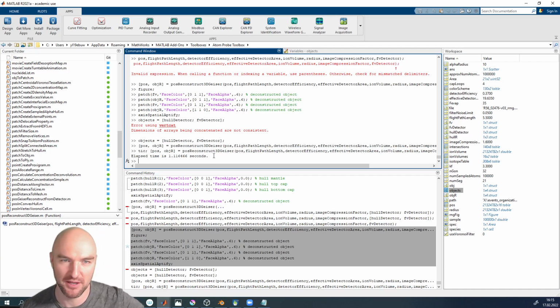yeah, so it takes about a second or so to reconstruct those 20 million atoms. It doesn't take very long. By the way, this is on the CPU. On this computer, you could also go onto the GPU, and then it would be a couple of milliseconds, and then it goes very, very fast. Okay, so let's create the isosurface then.